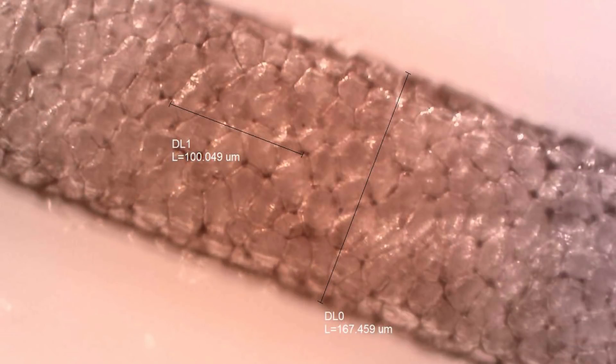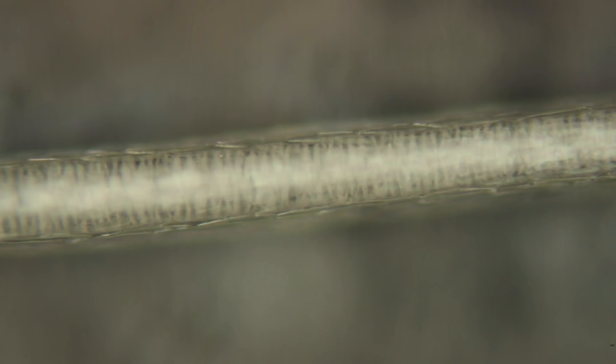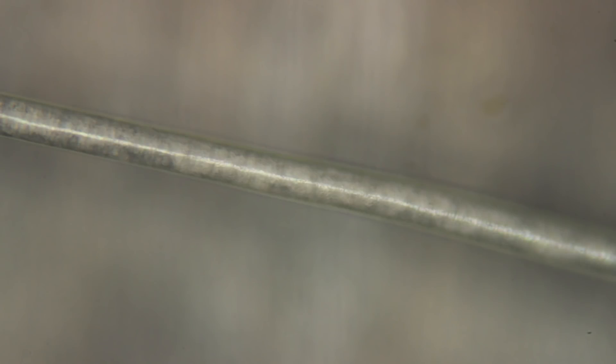There's a lot to consider when identifying hair for wildlife forensics: how the hair looks to the naked eye, how it looks under the microscope, specific measurements, sizes of the scales, size of the medulla, types of scales, and color distribution. Hope this gives you an appreciation for what it's like to analyze hair in wildlife forensics. I was thinking in the future I might do a wildlife forensics murder mystery game on the channel — let me know in the comments if you're interested. Thanks for tuning in — hope you have a great week, take care!